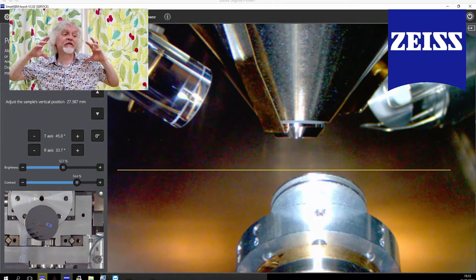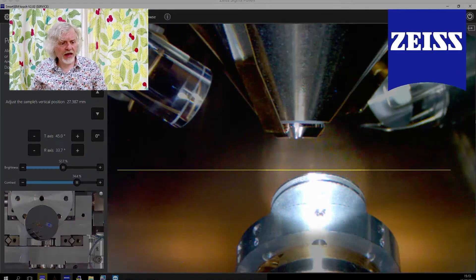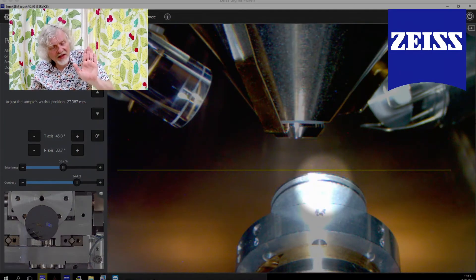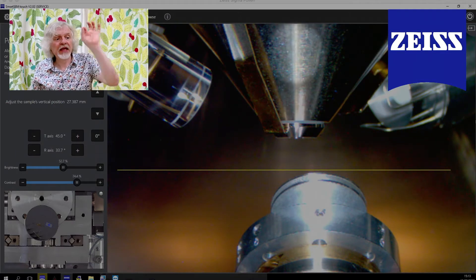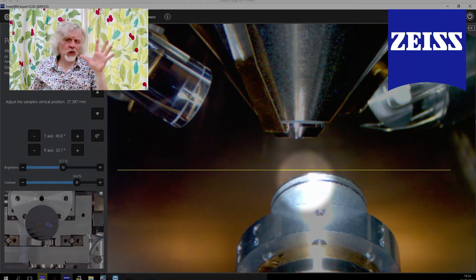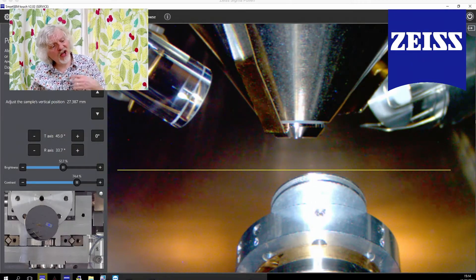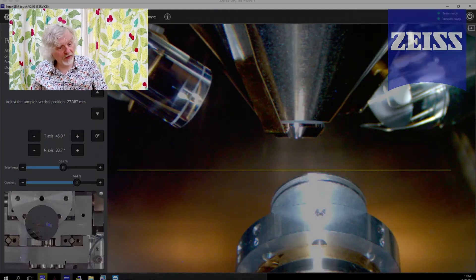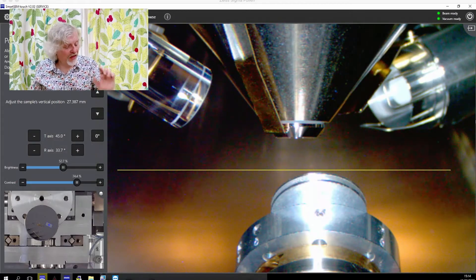What we have here is a view of the stage — this is where the specimen is sat. The stage is actually tilted away from us, which gives you a better view. This here is where the electron beam is coming down. This is an electron microscope; it's not using any light. It uses electrons in a thin, focused beam which are scanned across the specimen. You get electrons coming off the specimen which are then picked up by detectors — there's one detector over here, and another detector over here hidden behind this glass light pipe. Those are picking up the electrons and they're what give us the image.